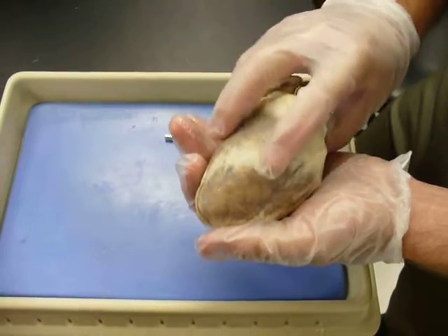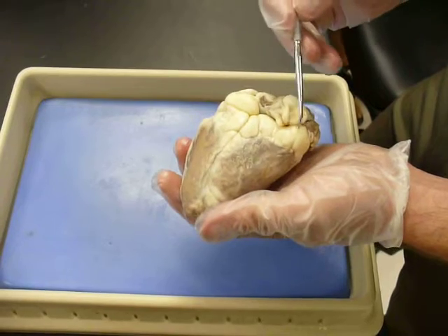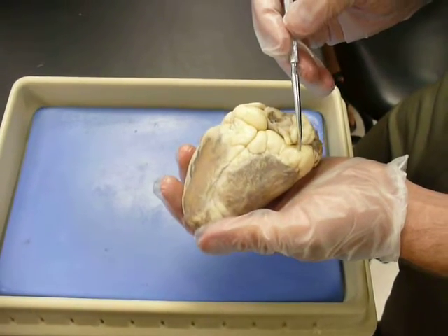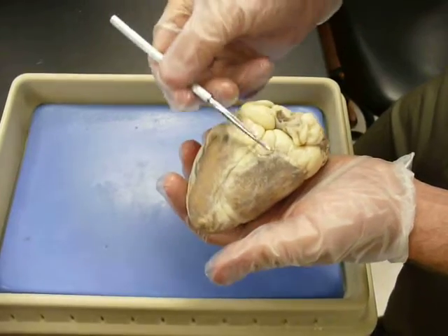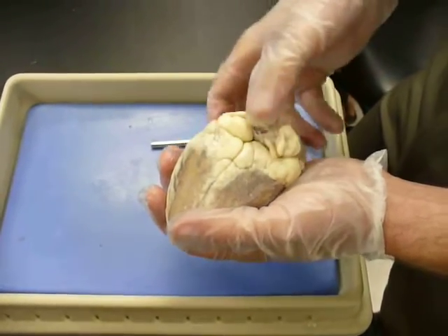The posterior — if you flip it over — you have this coronary sulcus that runs right through here. That's where you'll find your coronary sinus that carries the deoxygenated blood from the heart. The ventricles are below; the atria are above that coronary sulcus.